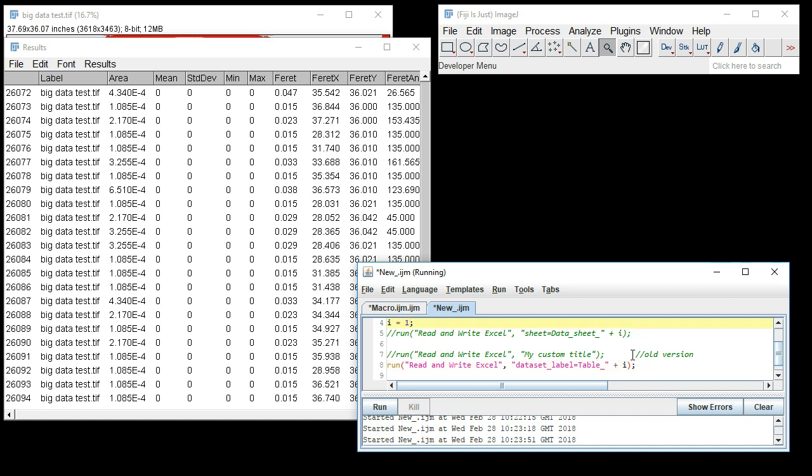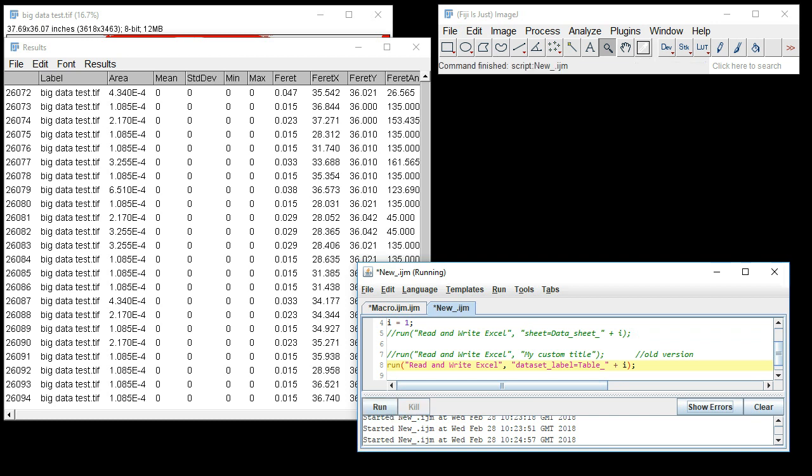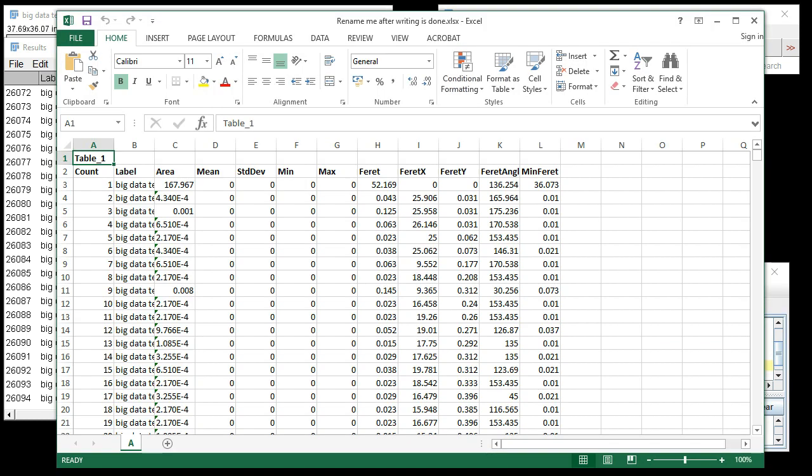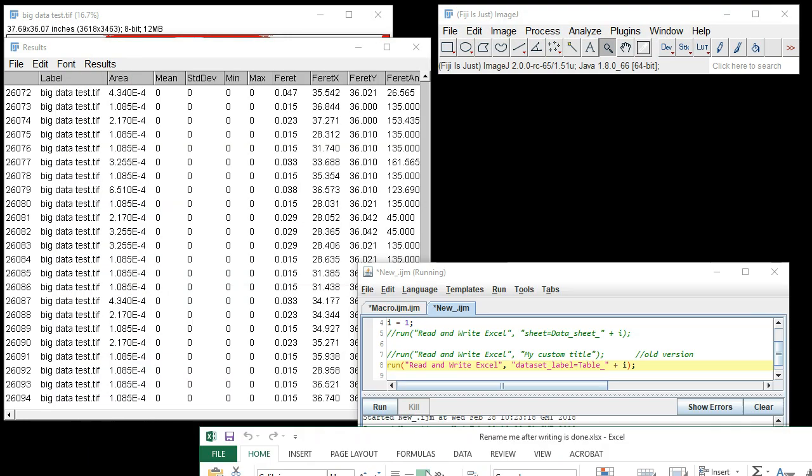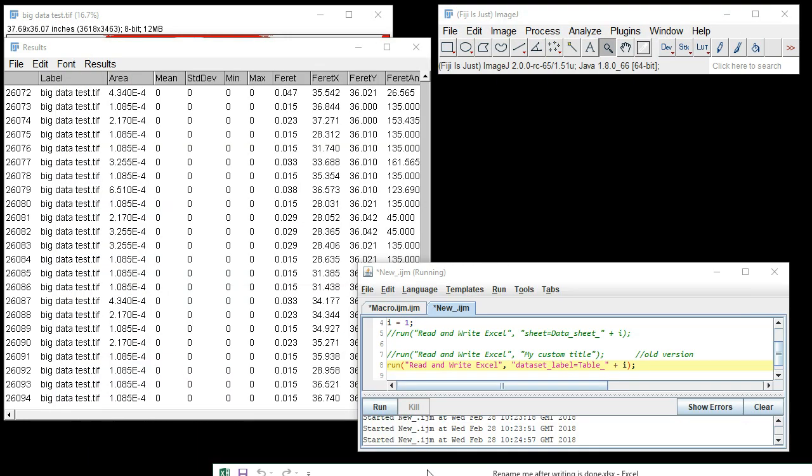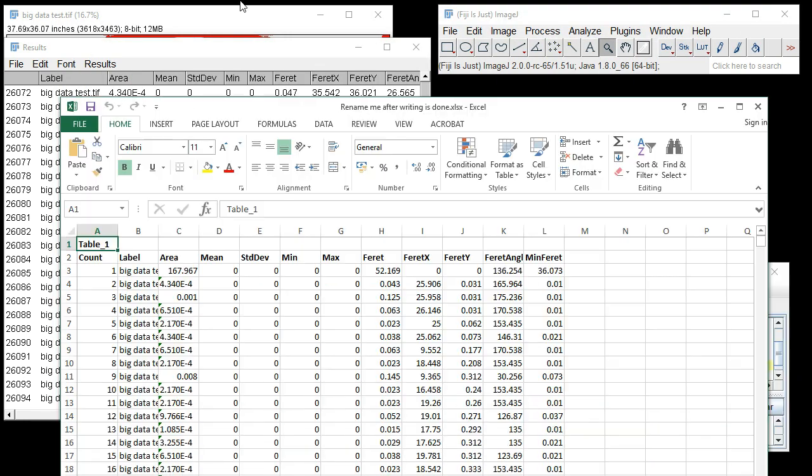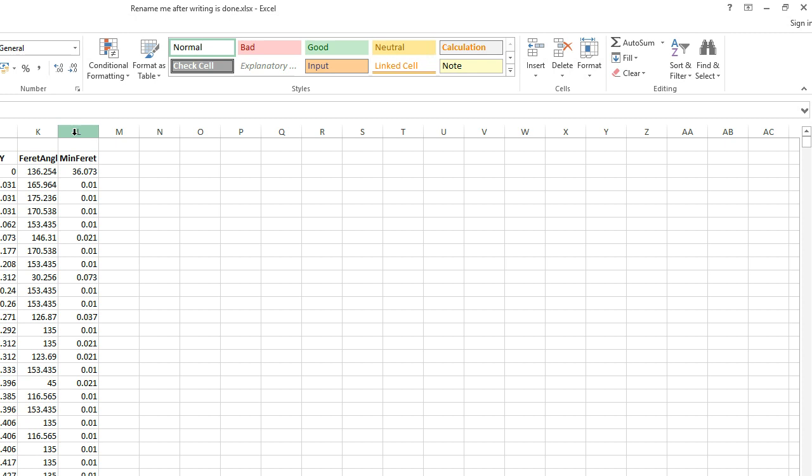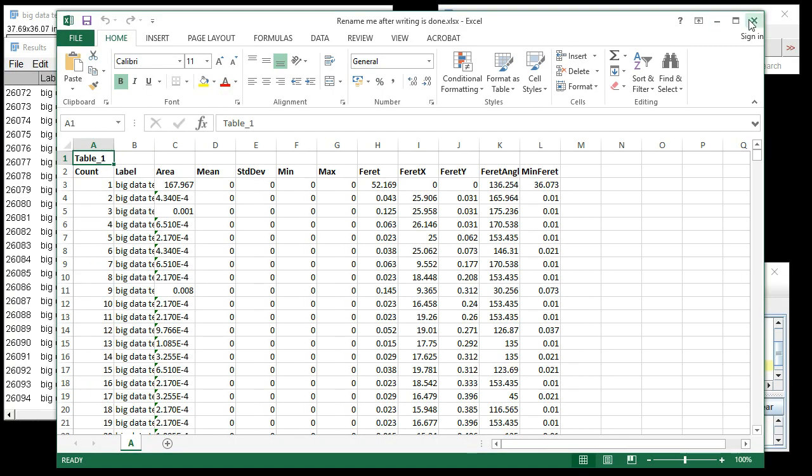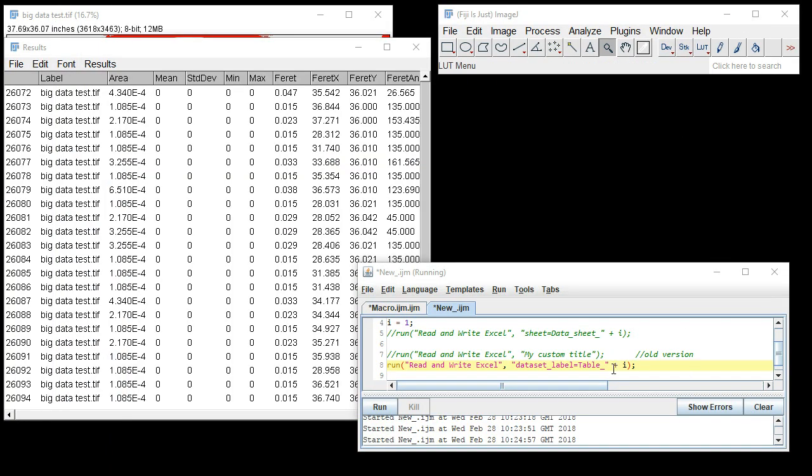If we run this, you can see that in our desktop file now, instead of the most recent open image being used as the data set label header, we have our custom label, which in this case is "table one." The important thing to note here is with any individual argument of this kind, you should not introduce spaces. I've been using underscores instead.